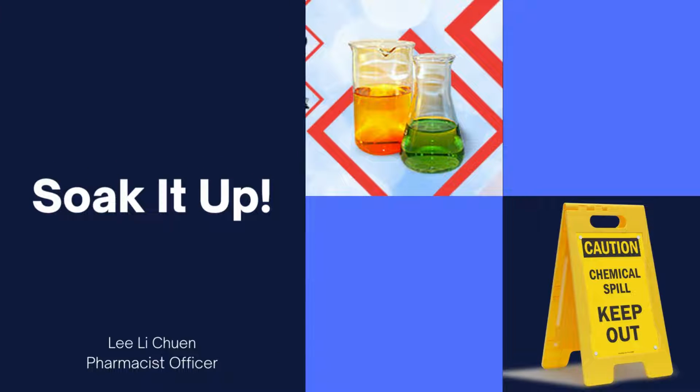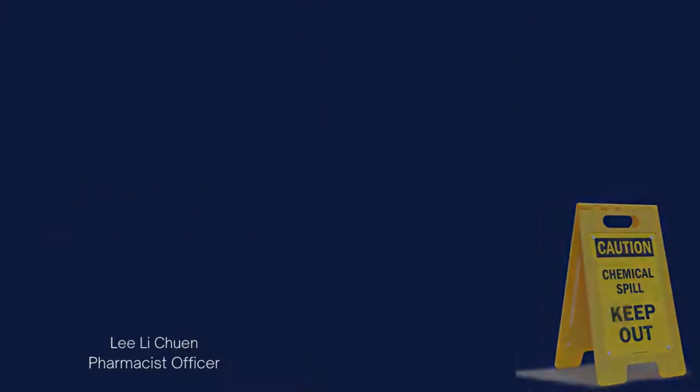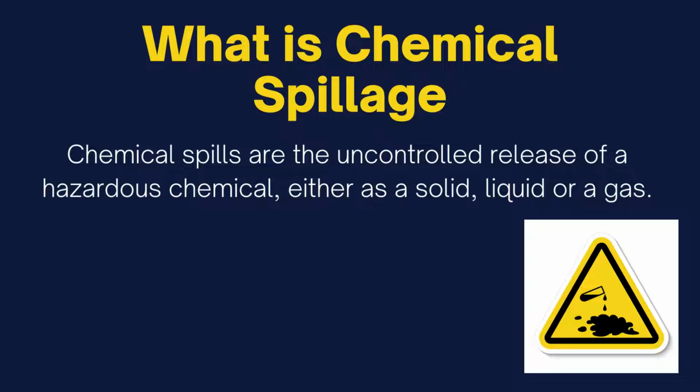Today, I would like to share on a title named Soak It Up. From the picture itself, it explains what I'm going to share today, which is ways and steps in handling chemical spillage. So when we talk about chemical spillage, what does it mean?